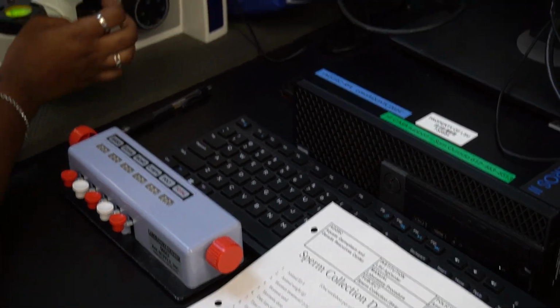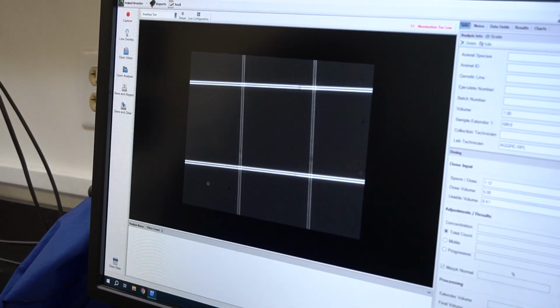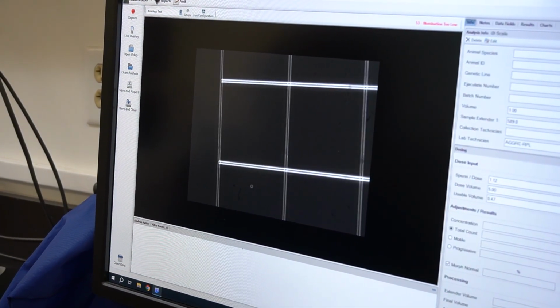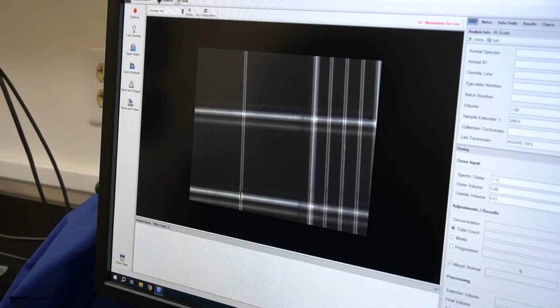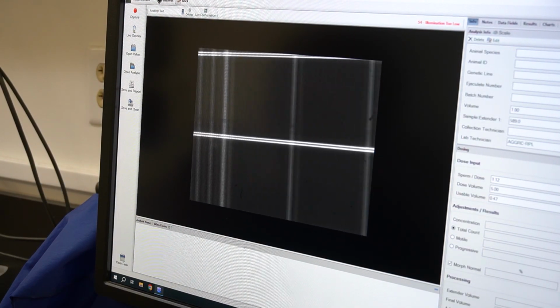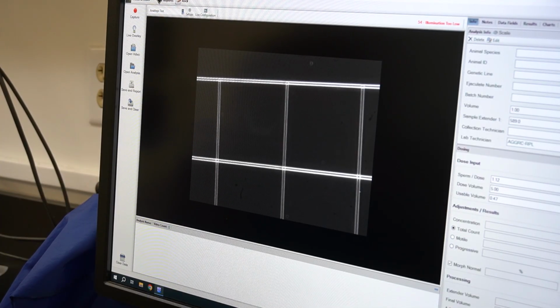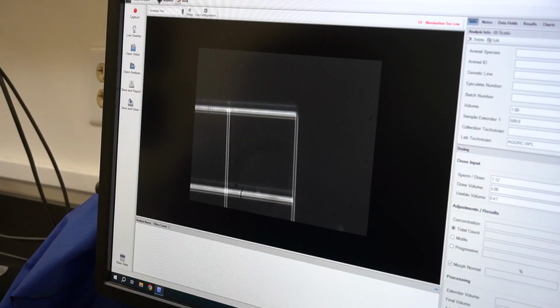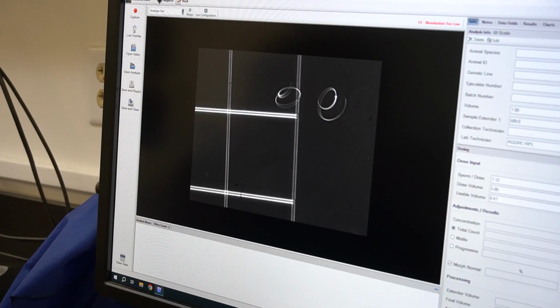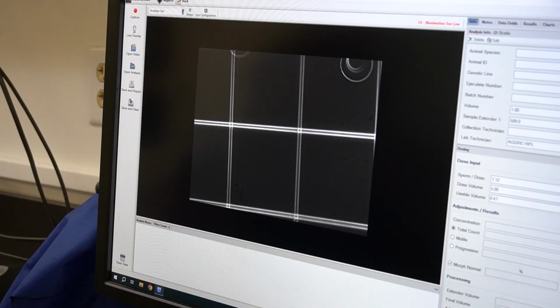And then I'll try and show you what I see. So I'm looking in this top left corner grid, and you'll see that there is none in here, so that's 0. We'll just move on to the next one. This section, our top right, we only really see 1 in here, so we'll count that one, and then we'll just move on.